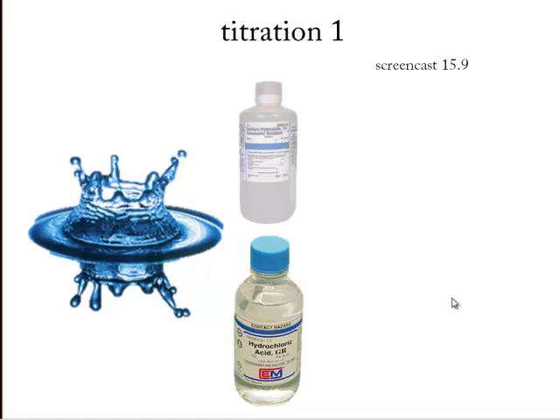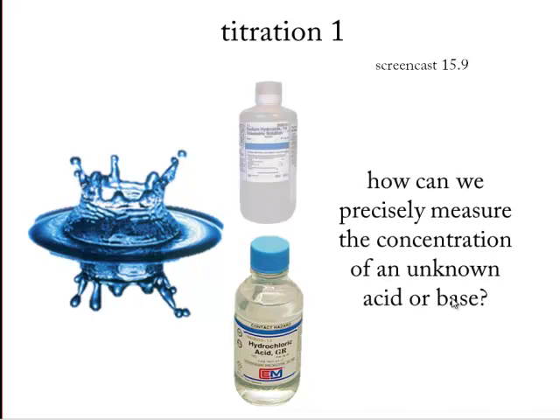An Introduction to Titration. This is Screencast 15.9. The main thing we're going to learn is how to do something practical: precisely measure the concentration of an unknown acid or base.